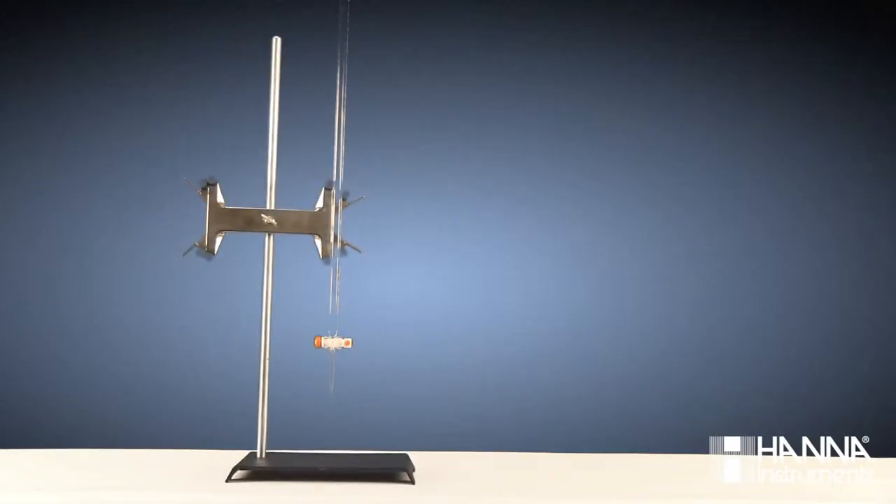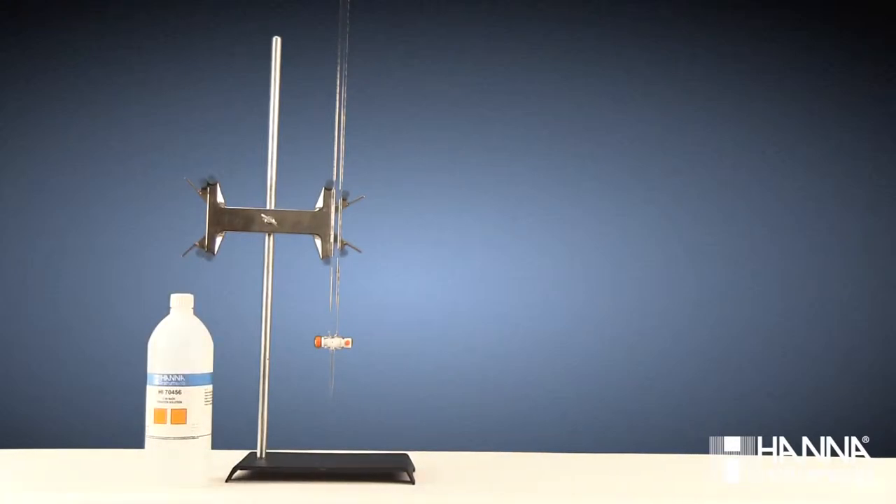To perform a manual titration, we'll need the following equipment: a burette and ring stand; our titrant, which today is HI-7046, 0.1 normal sodium hydroxide; and a stirrer and stir bar, such as our HI-190M.